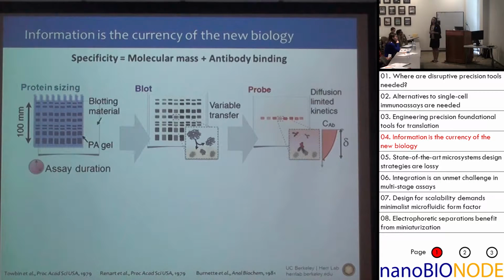to tell you about some of the classic ways that measurement scientists use to overcome this issue of the immunoassay, right? So the immunoassay, if you don't have a specific antibody, you're not going to get a specific signal, right? So that means the answer to your question is going to be squishy. You don't know how much signal is coming from your target and how much signal is coming from something else when you run an assay.